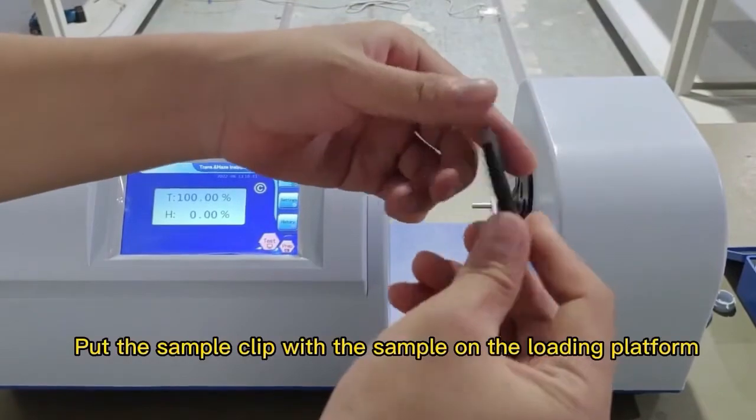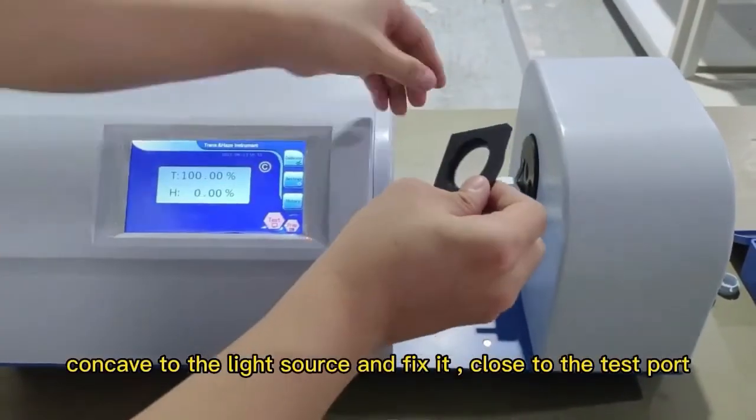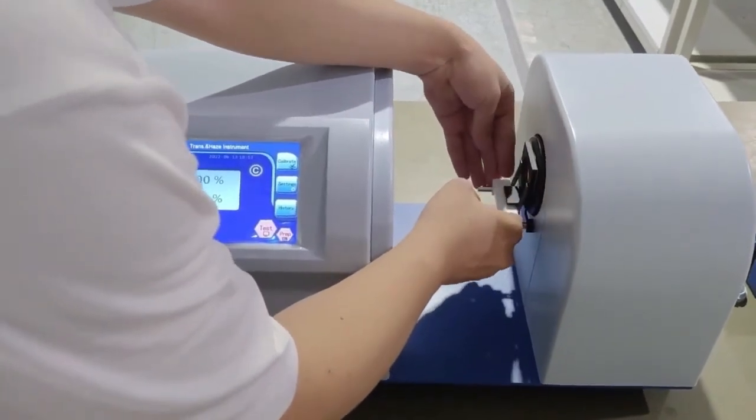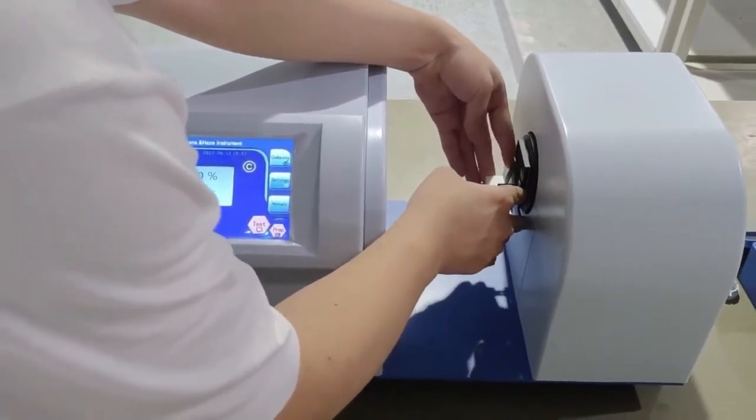Put the sample clip with the sample on the loading platform, concave side facing the light source, and fix it close to the test port. Press the Test key to enter the test and wait for it to finish. Once complete, the result data is displayed.